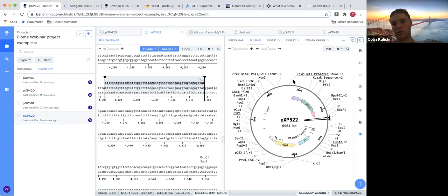So we'll just order this part here, and then ourselves, we have the restriction enzymes, and we'll modify our plasmid that already has its parts and cut out things we don't want, and so on and so forth. It kind of sucks to do those experiments, I'm going to be frank with you, but that's life in the city. You just got to live it sometimes. You got to get your hands dirty.